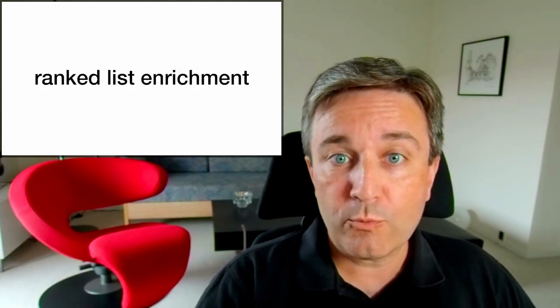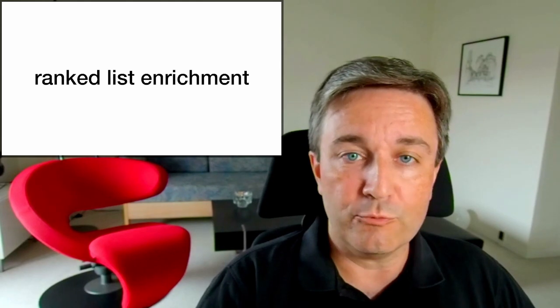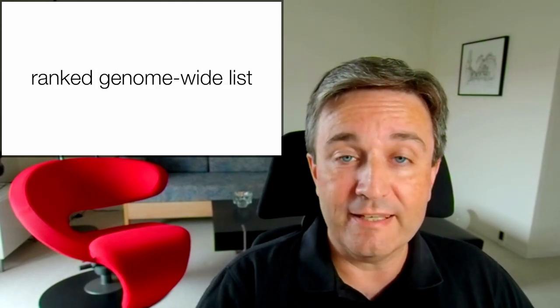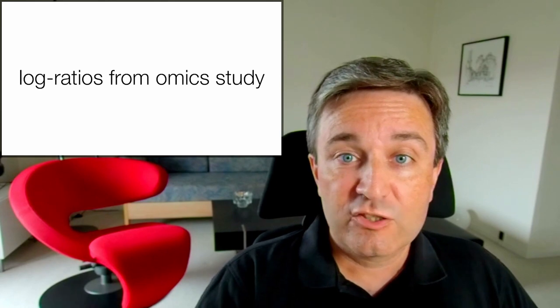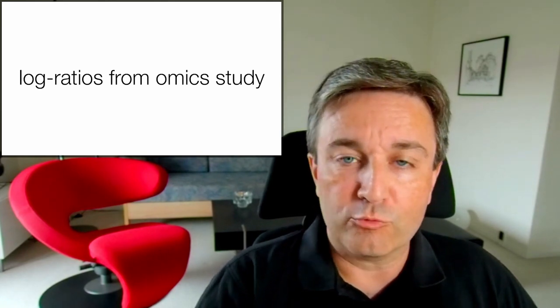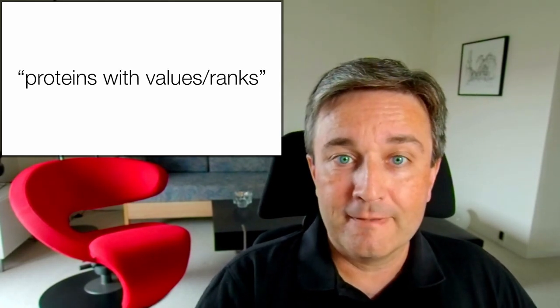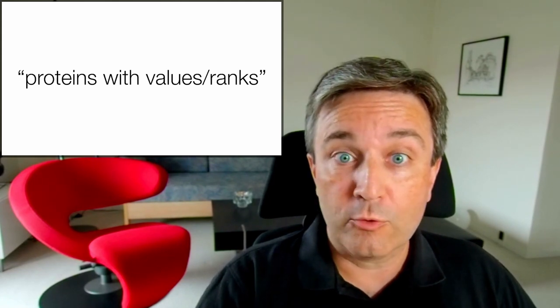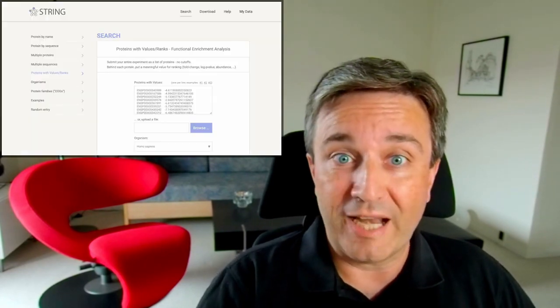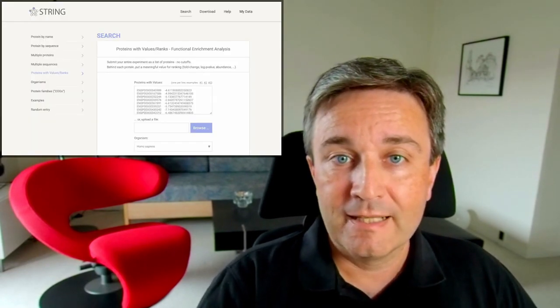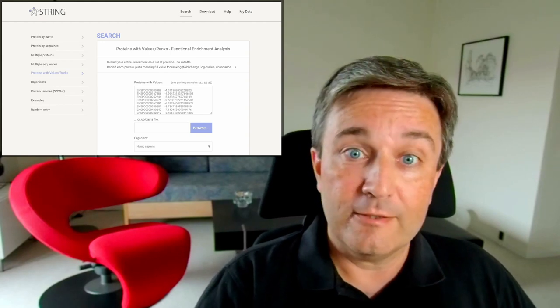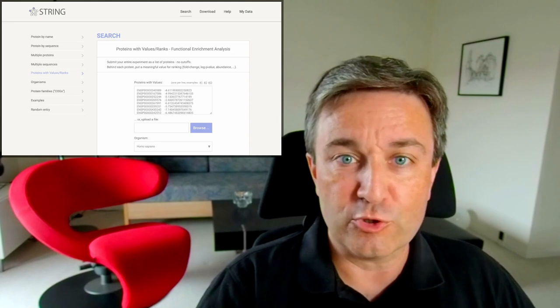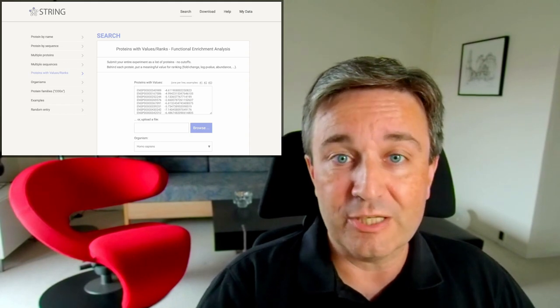The second way of doing enrichment is ranked list enrichment. In this case, you provide a ranked genome-wide list, typically in the form of log ratios from some omics study. You input these via the search option called Proteins with Values or Ranks. The interface looks like this — you can either paste in the data or upload a file, which is typically what you would want to do when it's a genome-wide list.